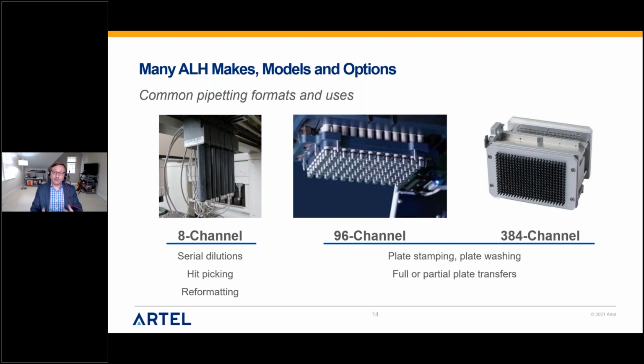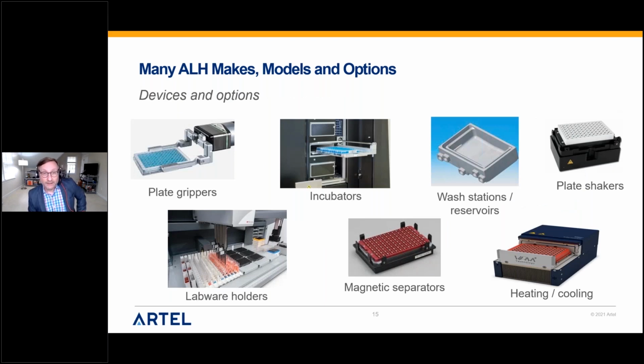And when you're considering purchasing, think about what your needs are going to be. Not just, I need an automated liquid handler. It's what it is you intend on doing. And I kind of mentioned this in a previous slide, it's about all these options. And I will tell you that the more sophisticated automated liquid handlers can accommodate pretty much anything that you see on this screen here.